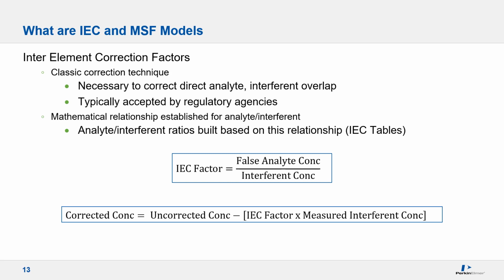Interelement correction factors are the classic correction technique which create a mathematical correction factor which is then applied to the sample analysis to correct for spectral overlap. If you find yourself in a regulated environment, IEC is generally acceptable.